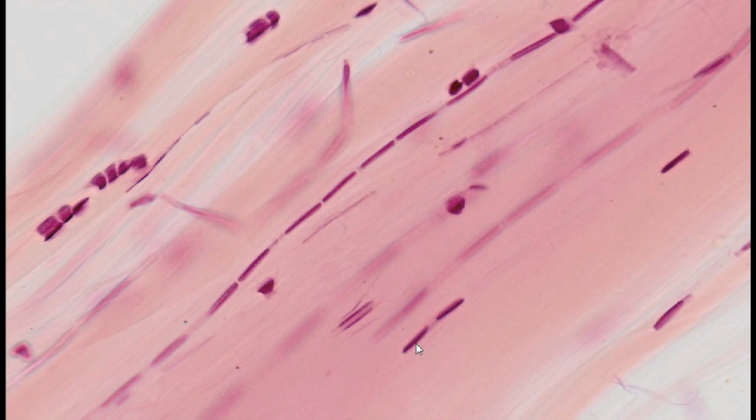The fibrocytes present are also referred to as tendon cells due to their characteristic extensions which penetrate between densely packed collagen bundles as flat cytoplasmic fragments.